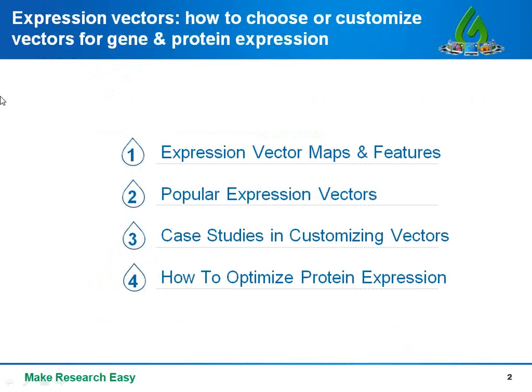My goal today is to introduce you to expression vectors. First, what are the critical features of vectors and how do you read a plasmid map to identify the features that matter to you? I've tried to make this more approachable than some other resources out there by organizing the content around the stepwise goals that you want to accomplish and then describing the tools available to help achieve that goal. Second, we'll look at the most popular expression vectors for bacterial and eukaryotic expression systems and discuss the pros and cons of readily available commercial vectors.